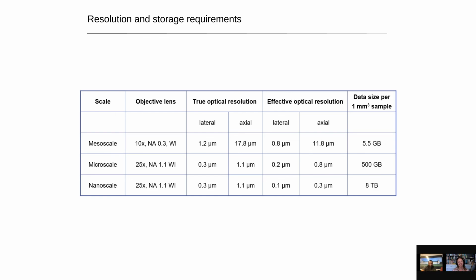As we mentioned, and as you can see in this table, going with a really high resolution to image the complete sample will be just too much data that will not give you actually more information than the one that you can get if you partialize your imaging session.